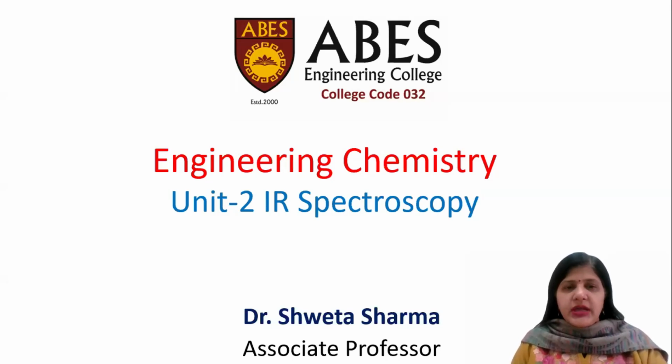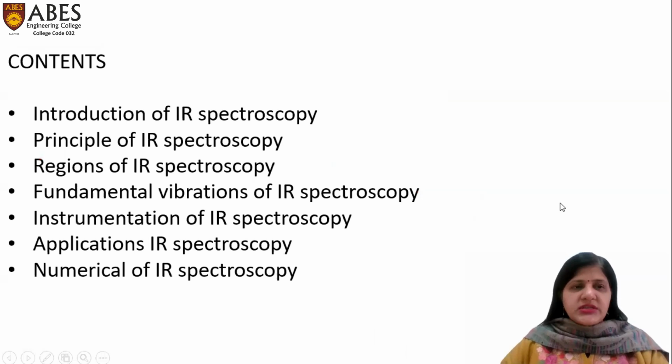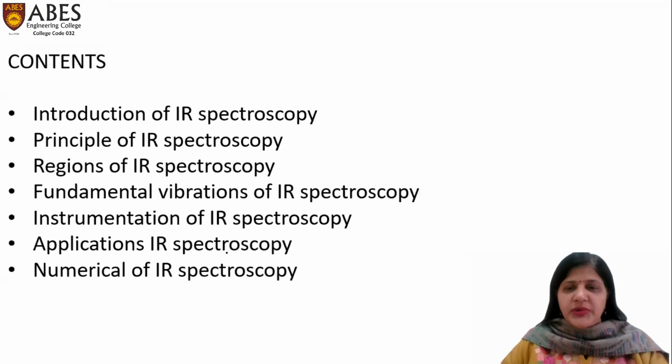In this lecture, I'll discuss IR spectroscopy. I will discuss these mentioned contents in the lecture: the introduction, principle and regions of IR spectroscopy, the fundamental vibrations of IR spectroscopy, instrumentation and applications of IR spectroscopy, and some questions related to IR spectroscopy.